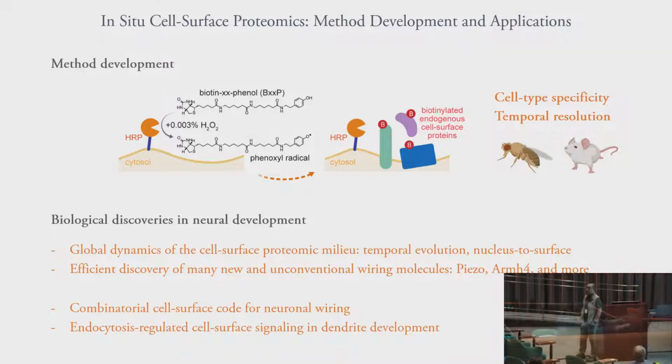Exactly, that's a really good question. Alice's paper with Kendall did synaptic profiling, and there is another story I recently heard at the mass spec meeting where they fused it to the AIS, axon initial segment, and can profile the proteome there. So if you can use something to guide this HRP to a different compartment, you can do that. Alternatively, just fuse it with an antibody, and then you can guide it to that nearby neighborhood and profile that area.